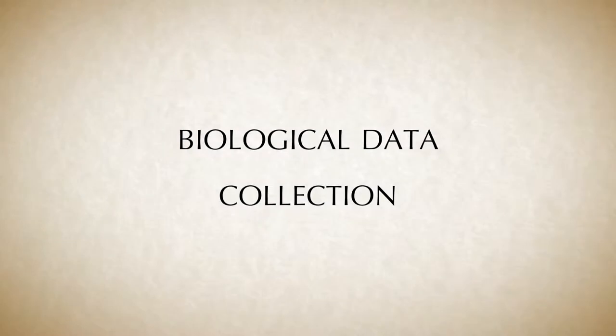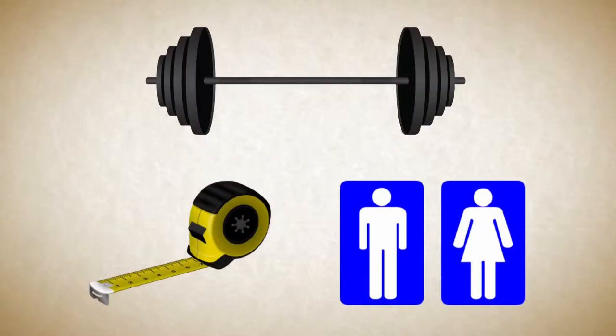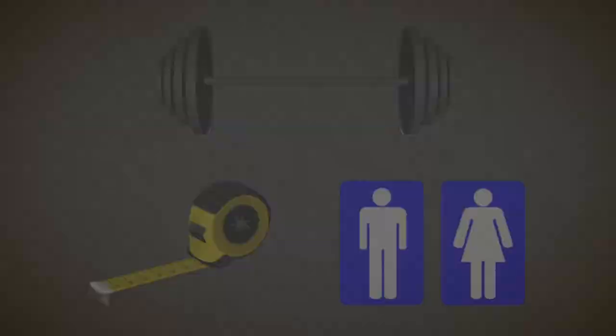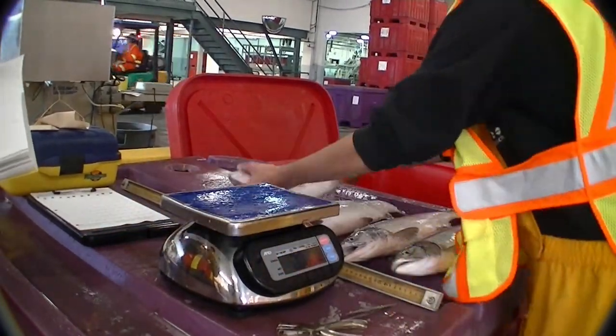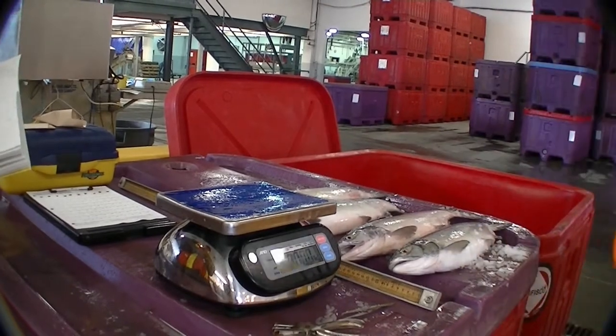Now we'll go into more detailed instructions on the components of a biological sample, starting with the weight, length, and sex. To record weight, simply place the fish on a scale in a stable position, then record the weight in pounds or kilograms to an accuracy of one decimal place.